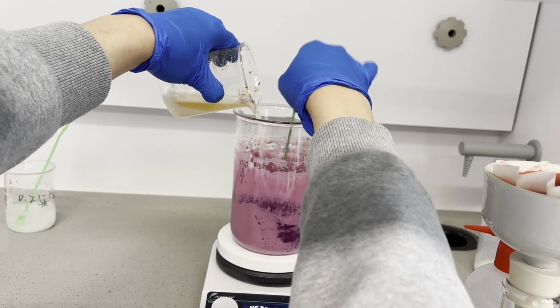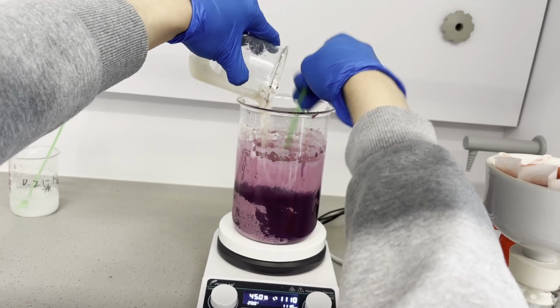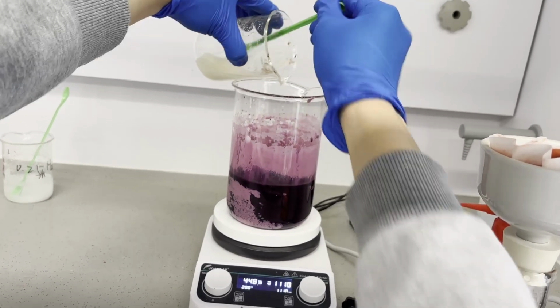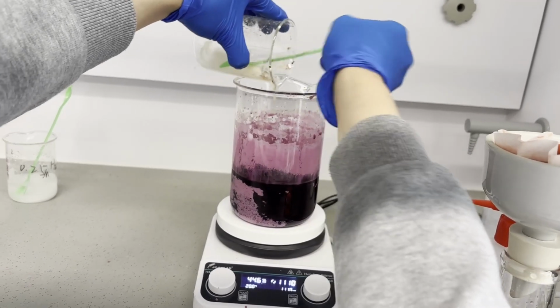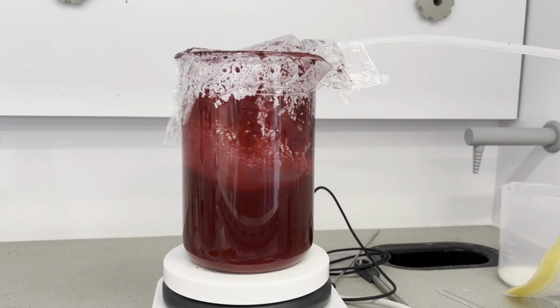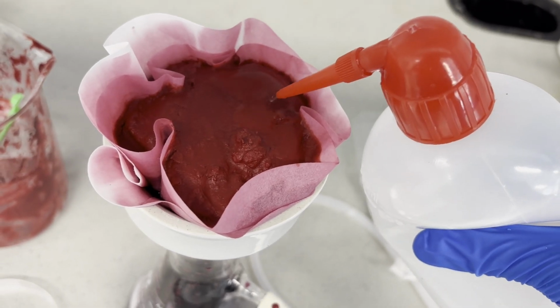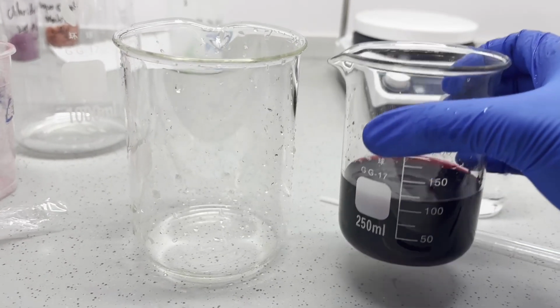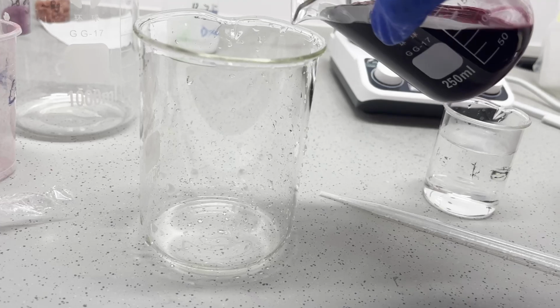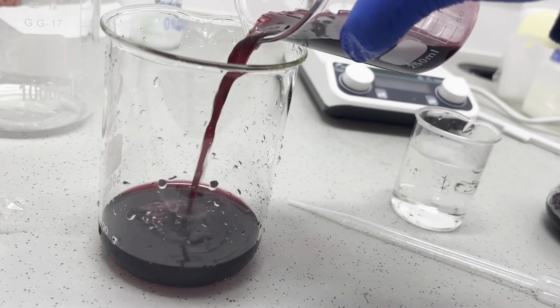The original procedure called for ammonium carbonate instead of bicarbonate, and I think the failure lies here since ammonium bicarbonate has a lower solubility and cannot reach a high enough carbonate concentration. Anyways, air was blown through the mixture for 22 hours, and the crystals were filtered. Everything seemed okay, but when I tried to recrystallize the salt with water, the color of the product was a dark pink instead of the light red-brown in literature, so I think I've got a bunch of aqua complex nitrate salt.